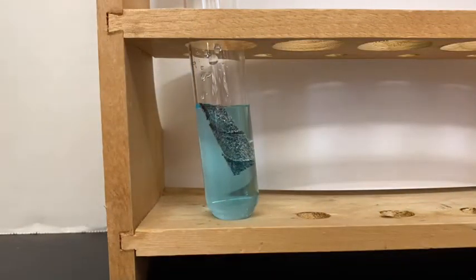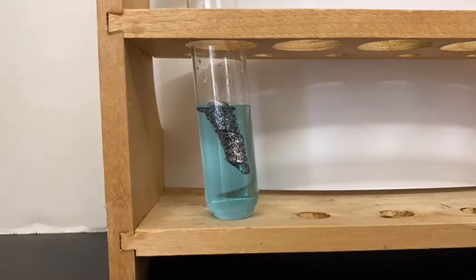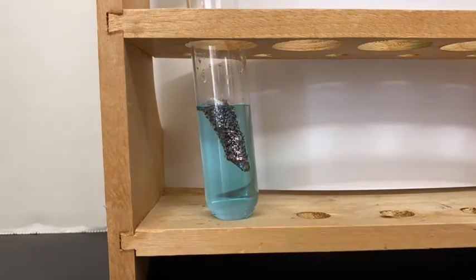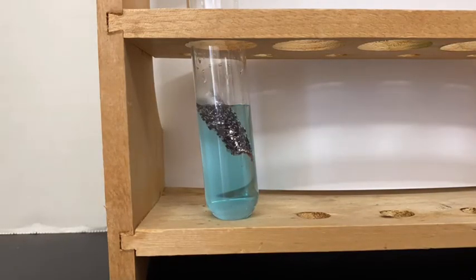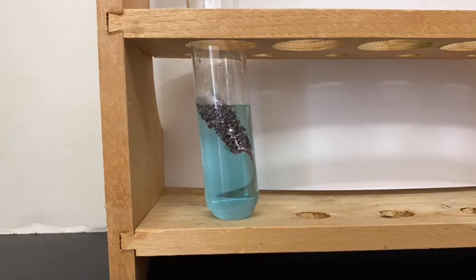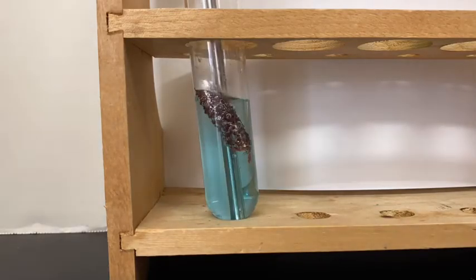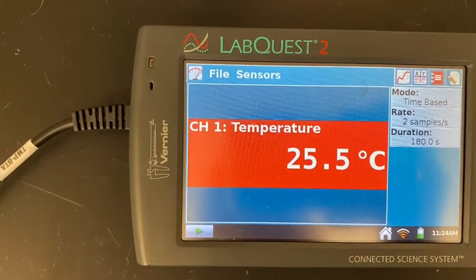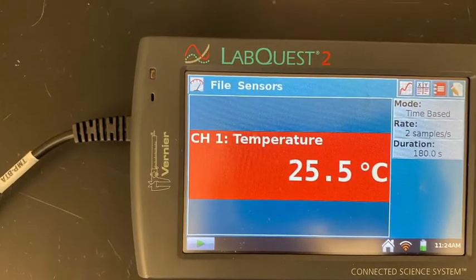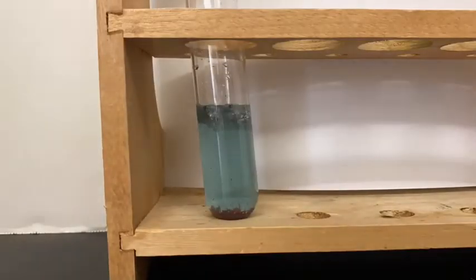This is a time lapse here, just so you don't have to sit here for 10 minutes. I added enough copper chloride solution so that it covered the aluminum foil. The bubbles are causing it to float a little bit. About halfway through, I recorded the temperature.